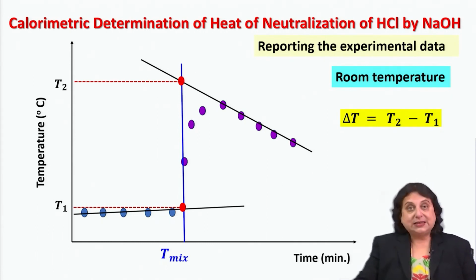And then the system, which is now an open system during mixing without that lid, there will be immediately heat loss, irreversible heat loss from inside the calorimeter to outside. Was this present before the mixing? The answer is no.